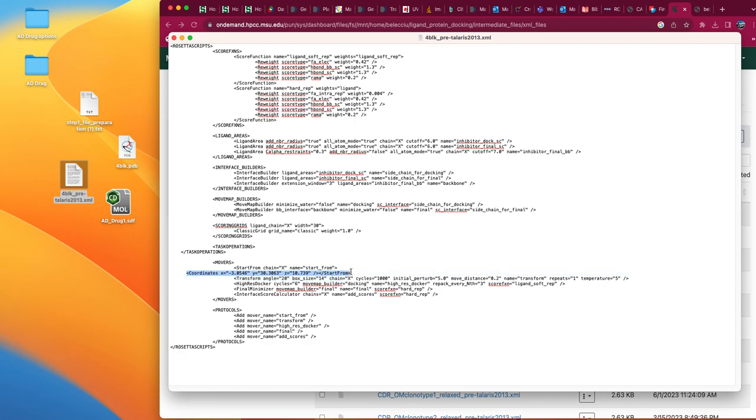These are not the ones we used. These were the ones based on the CASTp input, and I didn't actually bother to check if the atom that we selected in the beginning actually corresponded to the largest binding pocket identified by CASTp. I'm going to presume not, because the coordinates are very different, so I'm just going to change these to the ones mentioned. So you can just fill in the fields.